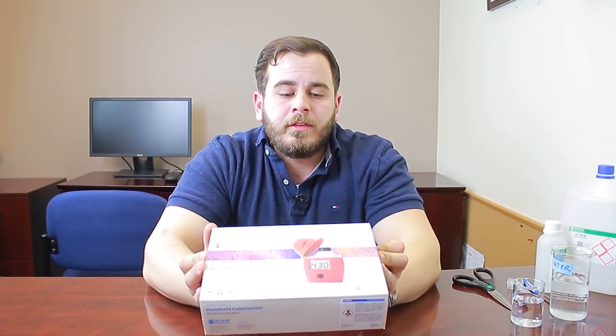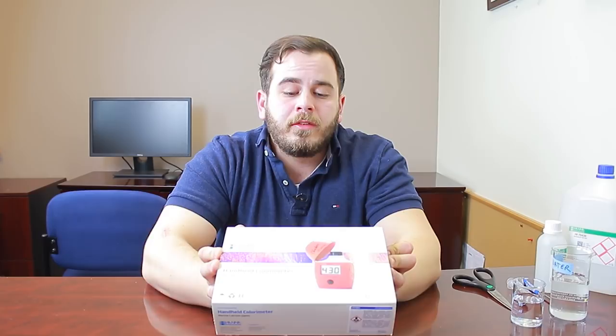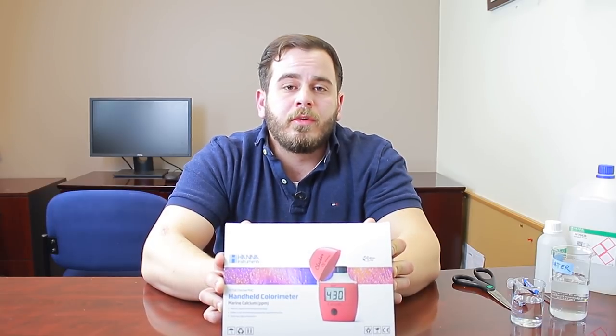One of the things we like to use here at Hanna Instruments to maintain proper calcium is our HI 758 calcium checker. This is a handheld colorimeter, so rather than traditional chemical test kits, this uses light to measure absorbance rather than matching a color to a chart. These are really nice because they don't have any subjective color changes, no titrations, no drops to count — it uses a digital readout to give you a precise number within a designated accuracy statement.